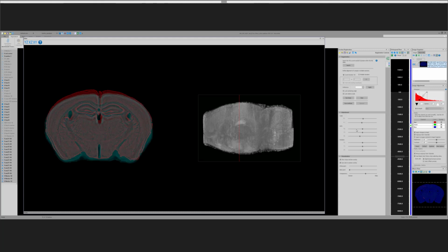When we get to this point, individual brains vary in terms of the XY scaling. That just happens. So we can move the brain itself. Now we're moving the Allen space relative to where the experimental brain is.